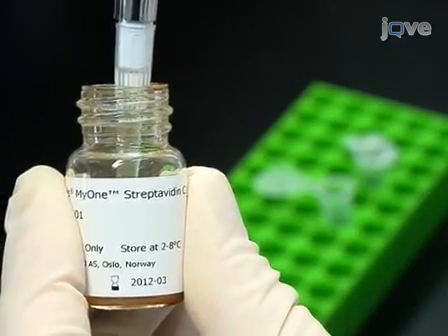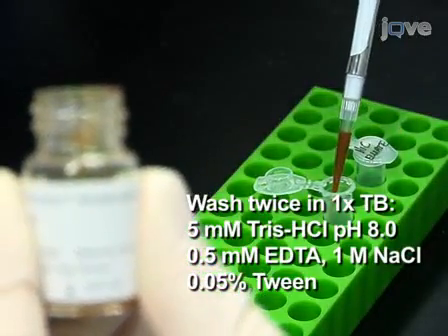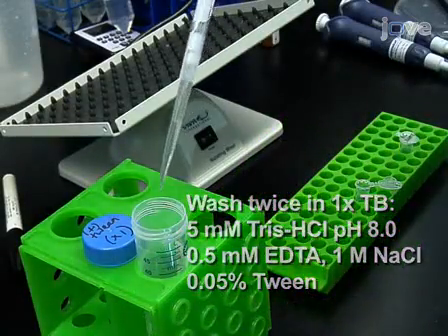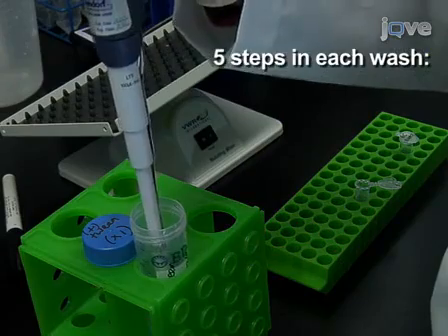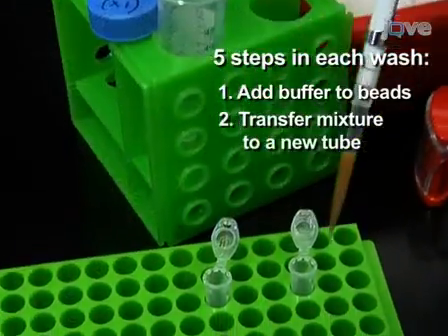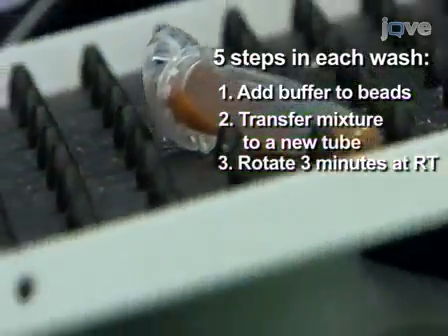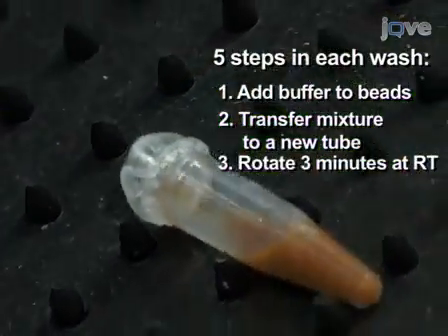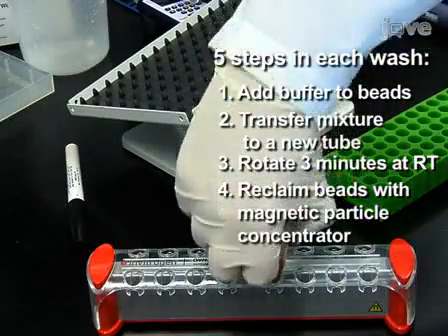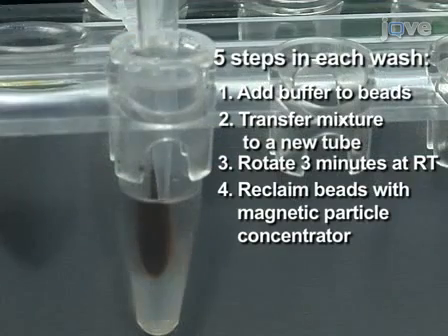Prepare beads for biotin pulldown by washing 150 microliters of resuspended magnetic streptavidin beads twice with 400 microliters of 1x tween buffer. These and future washes consist of 5 steps: adding buffer to the beads, transferring the mixture to a new tube, rotating the sample for 3 minutes at room temperature, reclaiming the beads using a magnetic particle concentrator, and removing the supernatant.